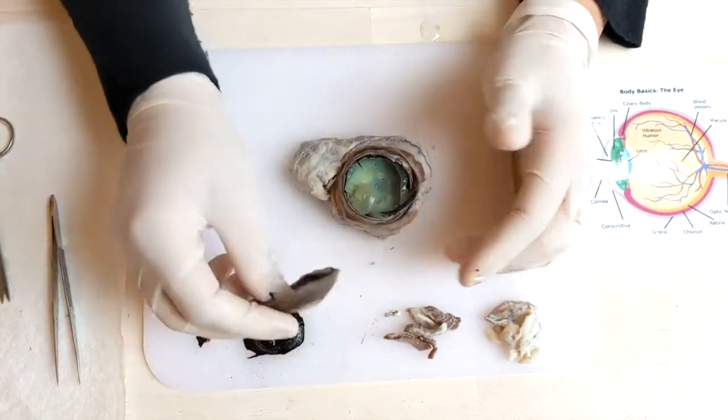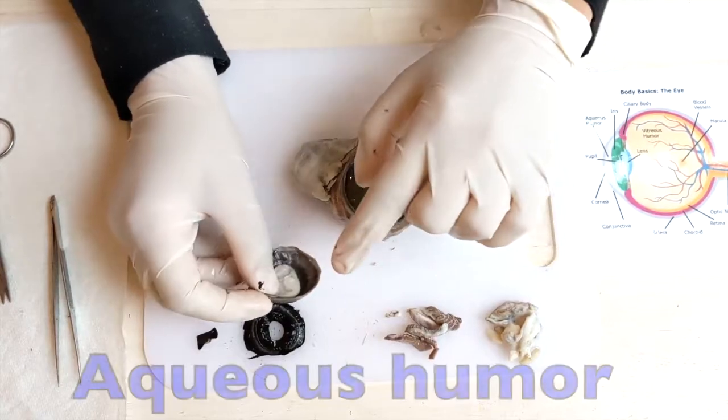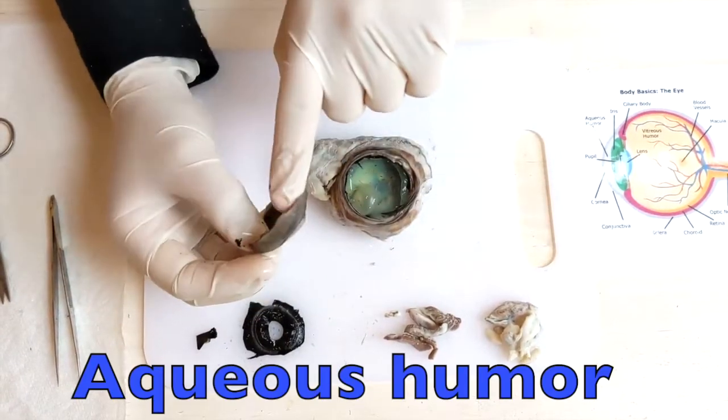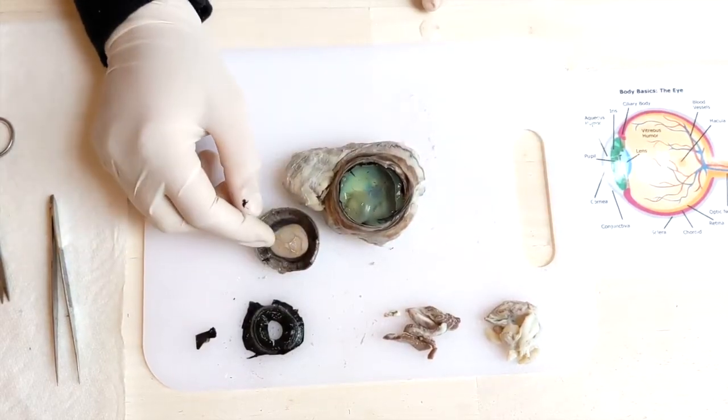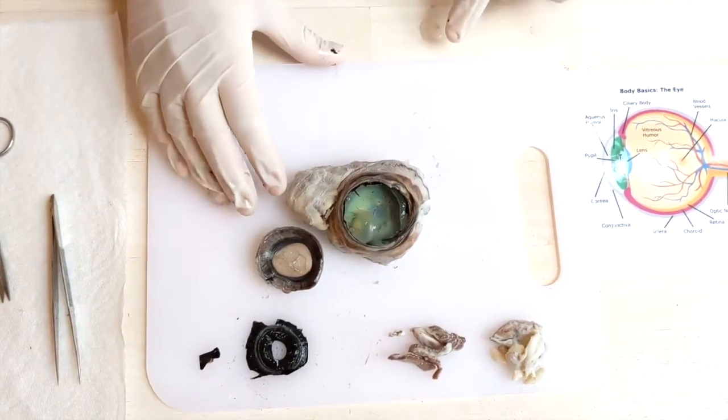Obviously. Okay, so there was the aqueous humor. It was actually right here behind, but when we opened it, I think it flew all the way over there. One drop? Oh, that's not good.